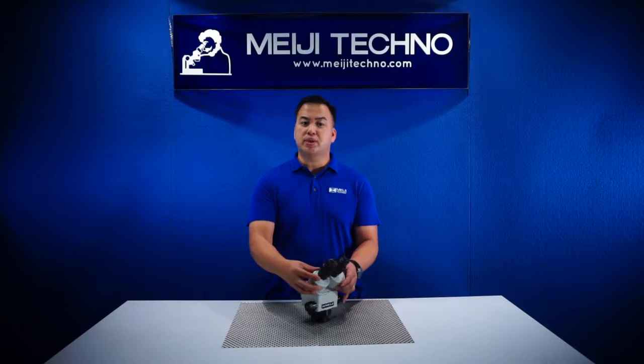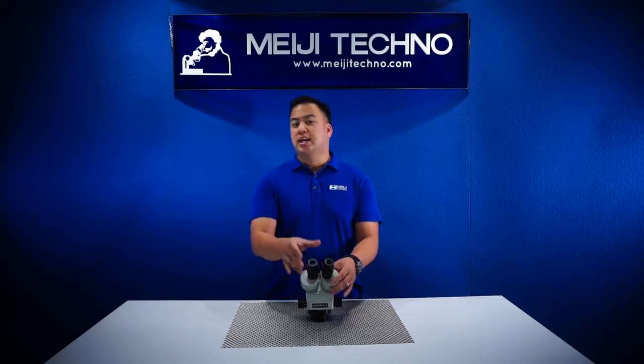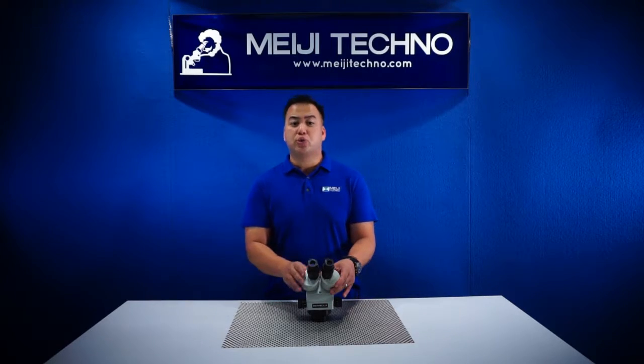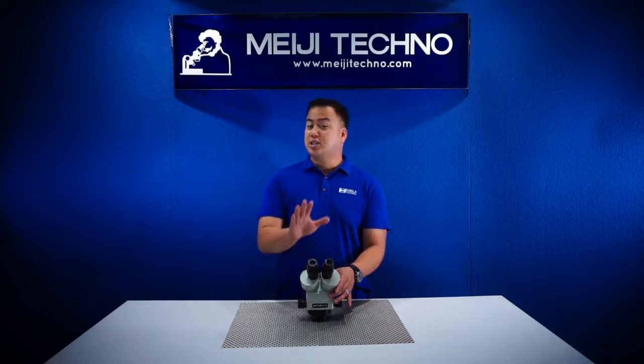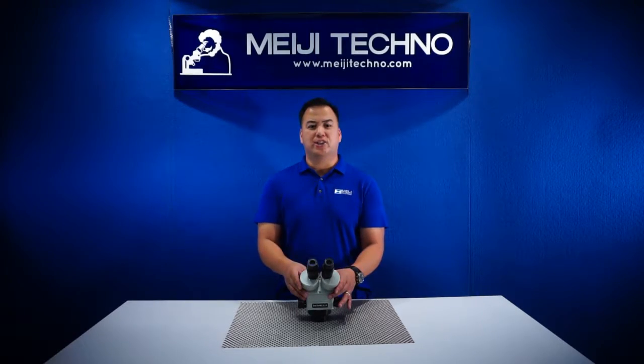With its dual diopter adjustment, the EMZ-13 allows the specimen to be viewed and to remain in focus all throughout the entire zoom range. The subject is in focus and par-focal throughout the zoom range.